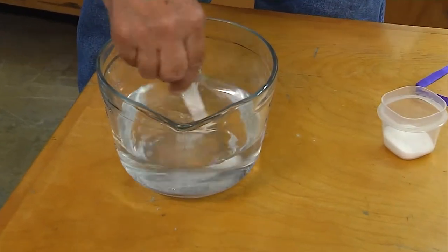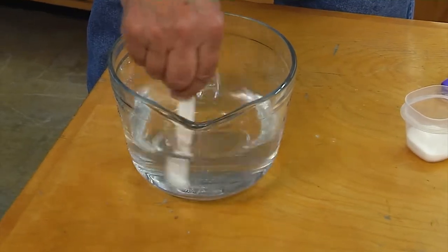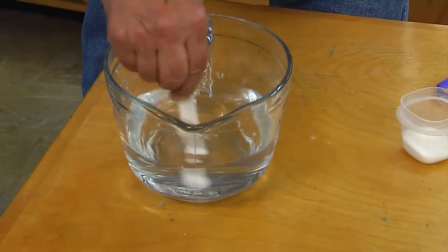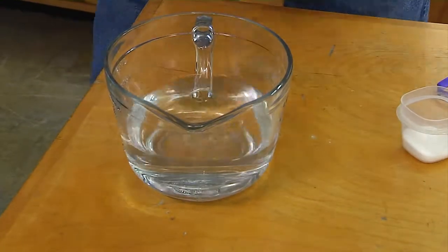So we're going to mix up the water, make sure that all the salt is dissolved, and we'll let it set for a little while to make sure it's finished.